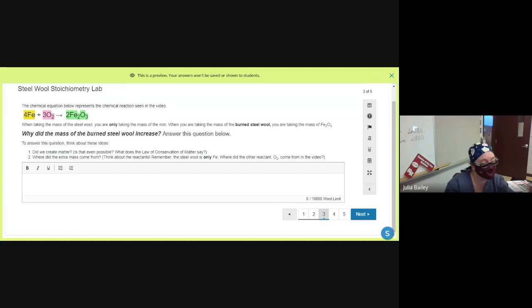So the iron was burning, taking oxygen atoms out of the air, and then combining to make a compound. And since that compound is iron oxide, each piece of the compound is not just the iron atoms that were already in the steel wool, but now also adding on oxygen atoms to it. The whole thing's getting heavier. I did just give you the answer to this problem if you were paying attention.